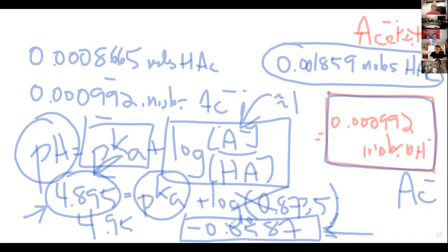Okay, because I got 4.836, so 4.84. Oh, did you subtract it? Oh, so we add it. You need to turn it into a positive. You need to add it. Oh, okay. Yeah, because remember, you're subtracting this number from the pKa and getting that number.